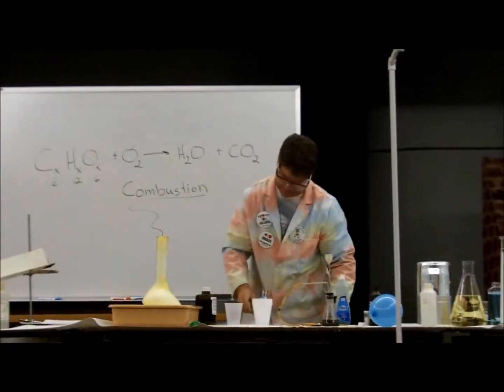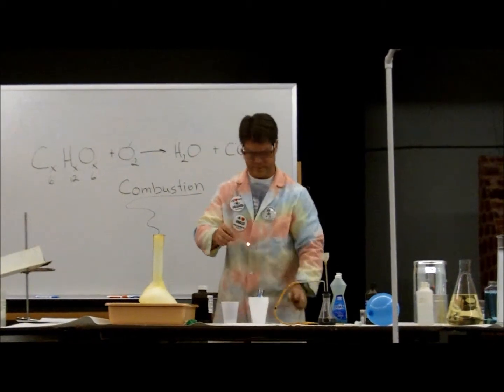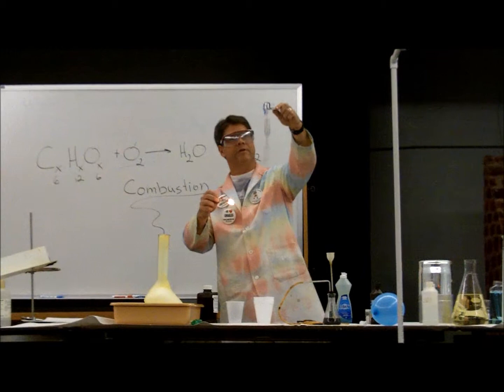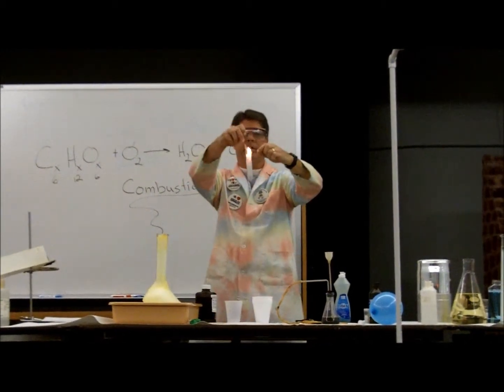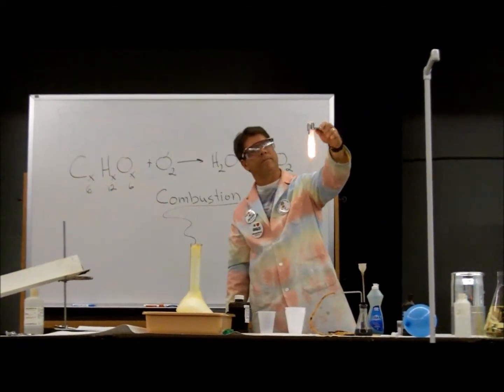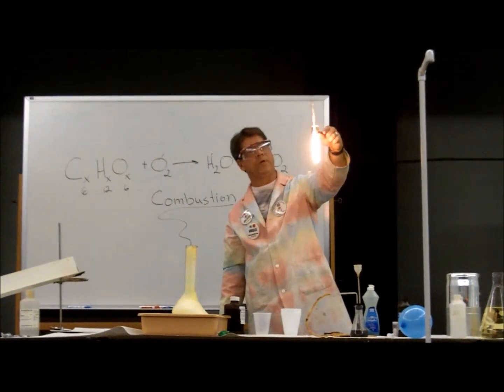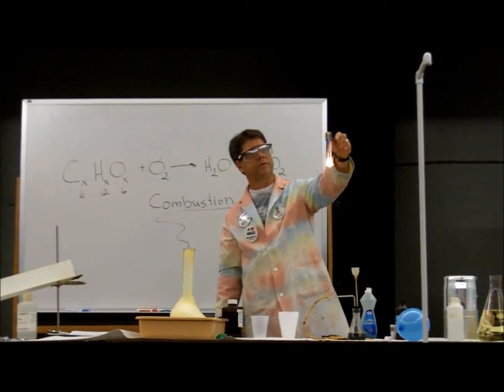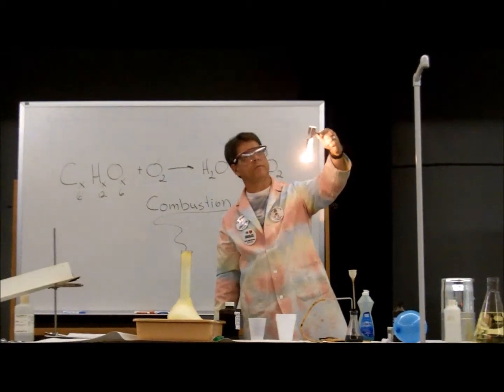Okay. More try. I don't believe I hit it. I think I got the oxygen. I have no idea. See, normally the oxygen's a nice blue color, and I can see from here this is not a very nice blue color. And it's not supporting combustion a whole lot. Yeah, a little bit. Again, this is just your typical wood splint that we had burning in the presence of a great deal of oxygen and some other contaminant, which I'm not sure about.